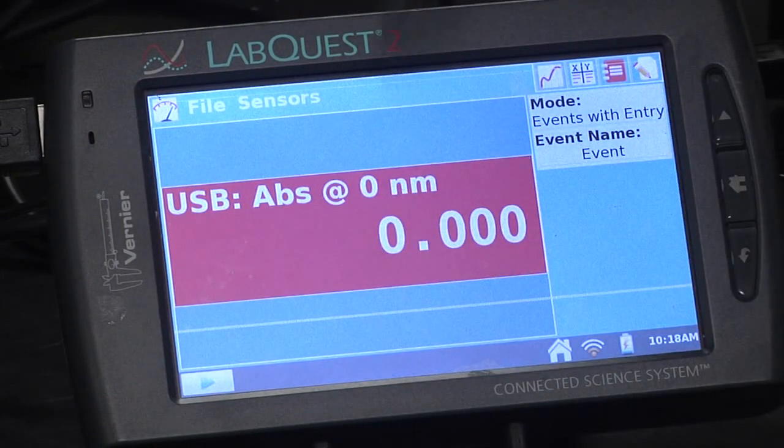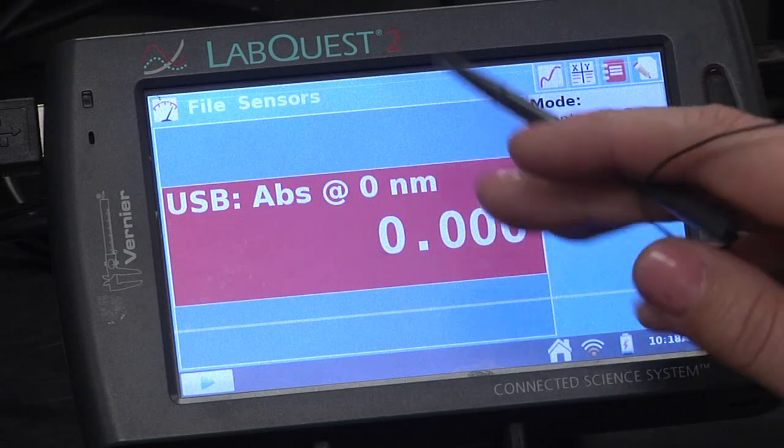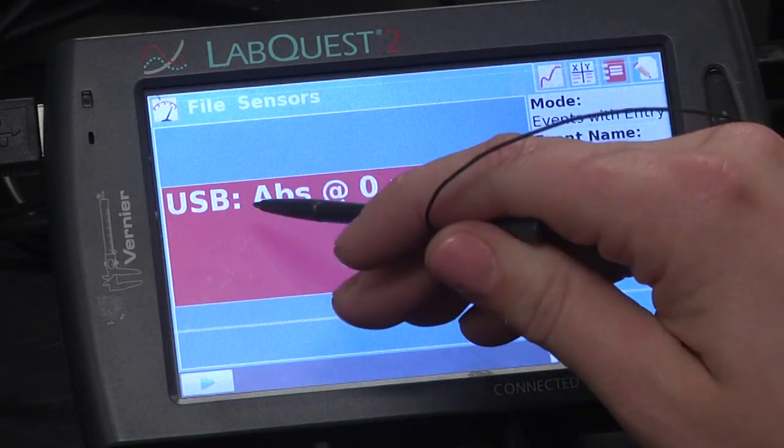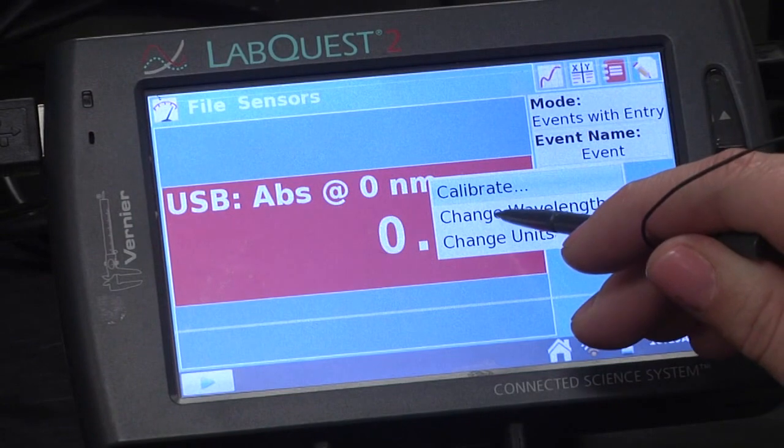Next we're going to want to change our absorbance to 447 nanometers. You're going to tap the red box and then press change wavelength.